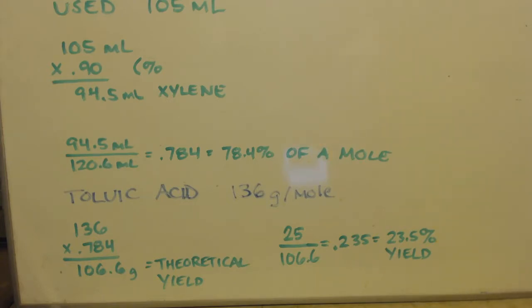My whole point to saying this is maybe you only have to reflux it for 4 hours, 5 hours. I don't know if it's 7.5. I just arbitrarily stopped at 7.5 because there was a lot of crap in there. I wanted to see what was up. So you might be able to reflux it for 3 hours and get the same amount. In the next 4.5 hours of that 7.5 hours, I didn't make anything hardly. I don't know. But next time, I will try that.